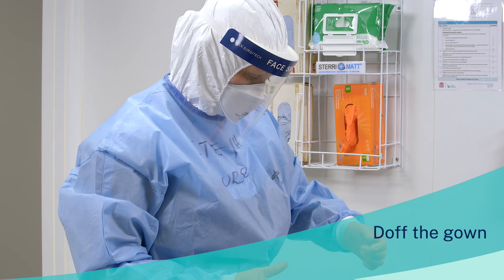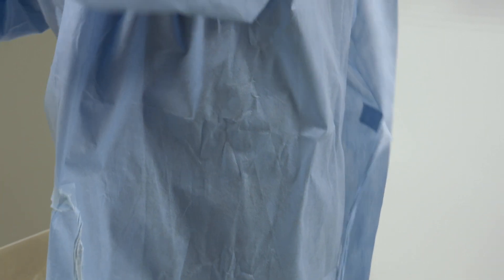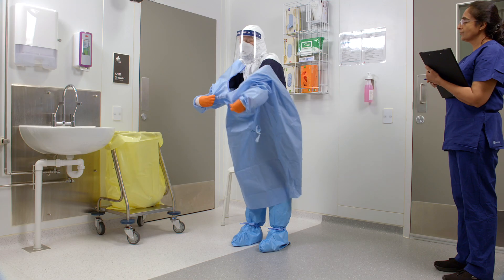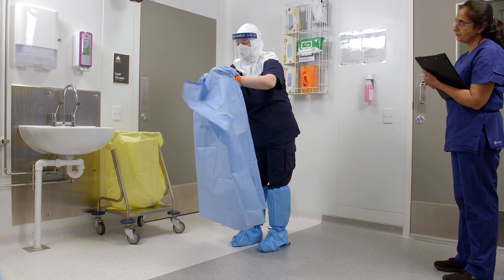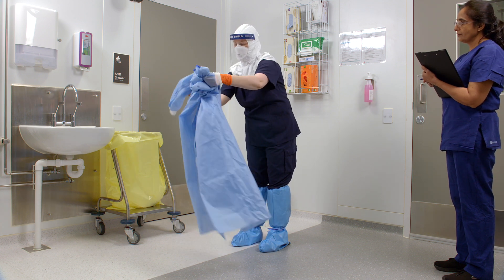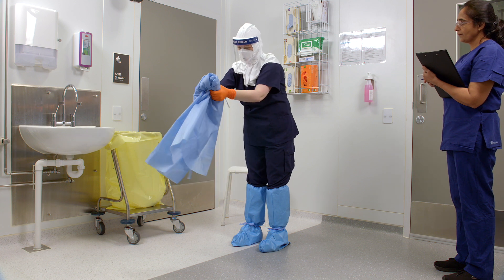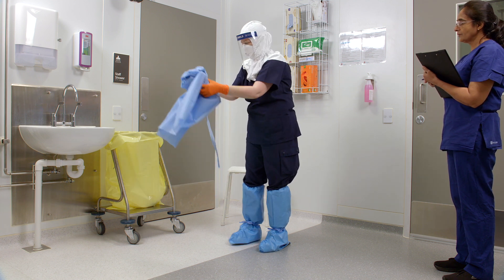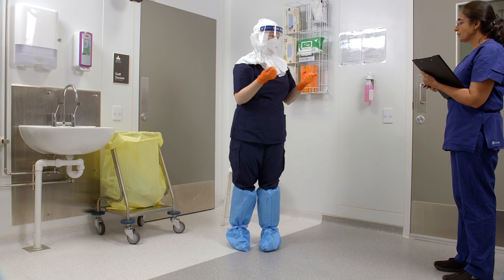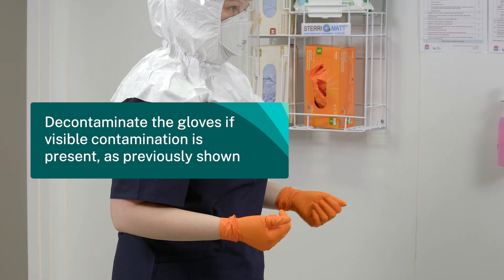Now, doff the gown. First, untie the straps of the gown. Pull the gown away from you. Roll it inwards and downwards. Make sure you bend forward slightly to reduce self-contamination. Discard the gown into the clinical waste bin. Inspect the inner gloves and remove any visible contamination with disinfectant wipes.